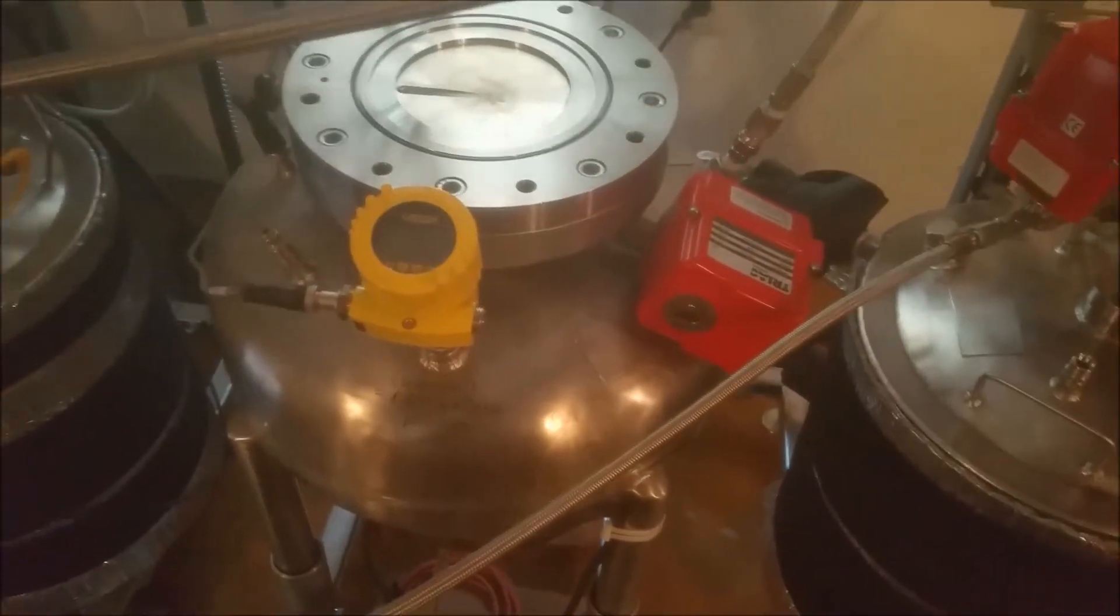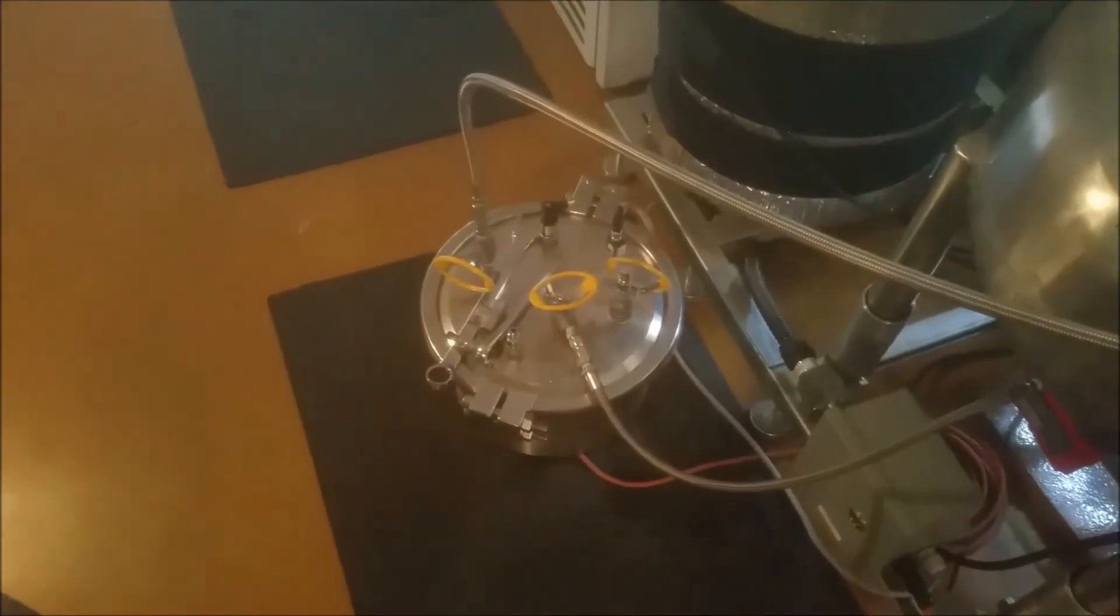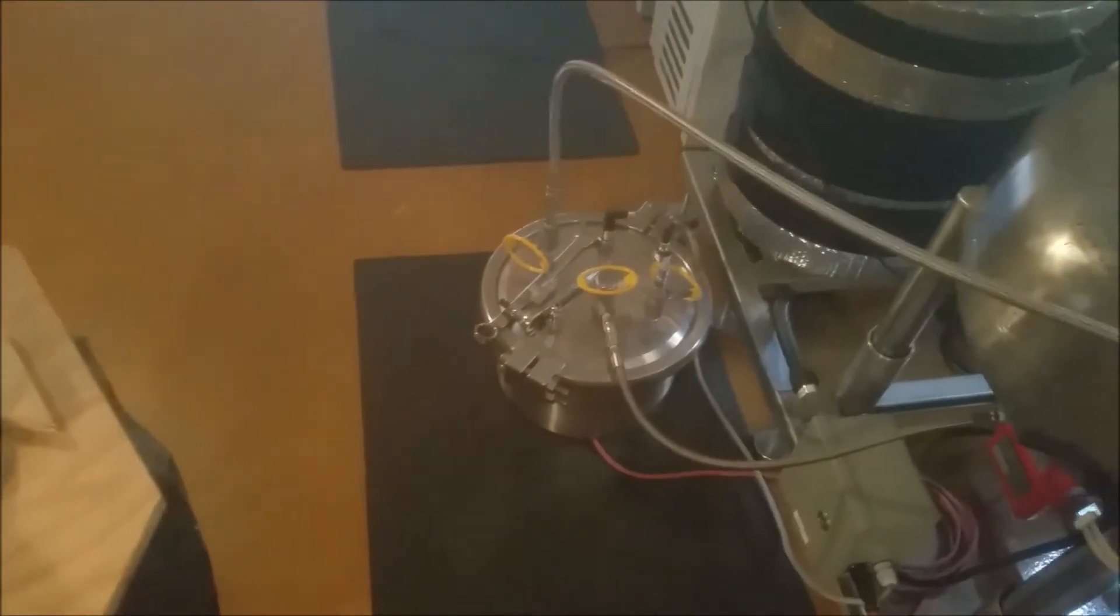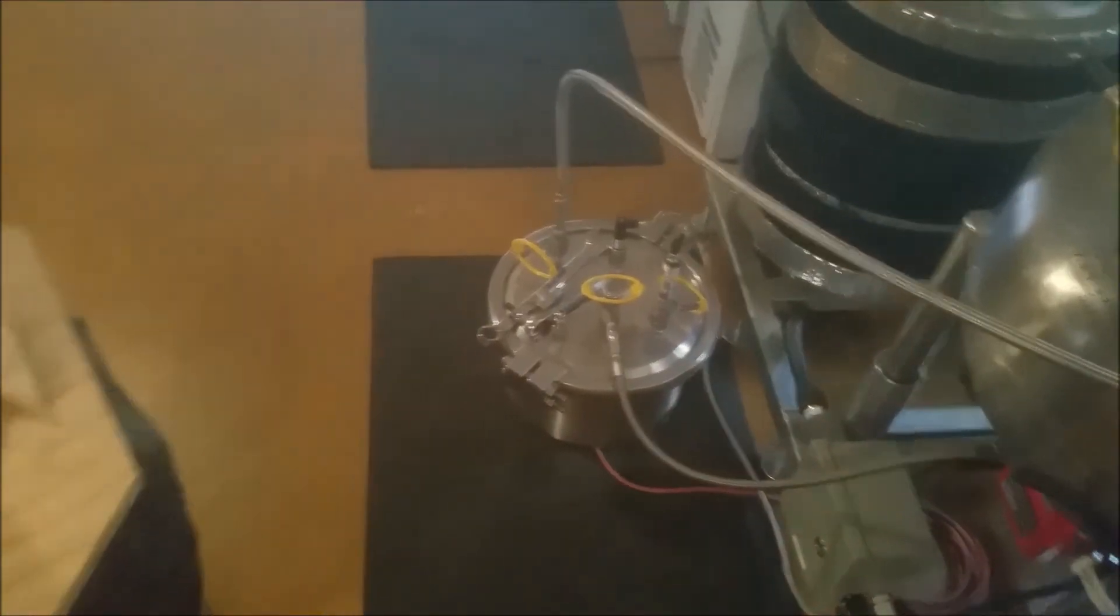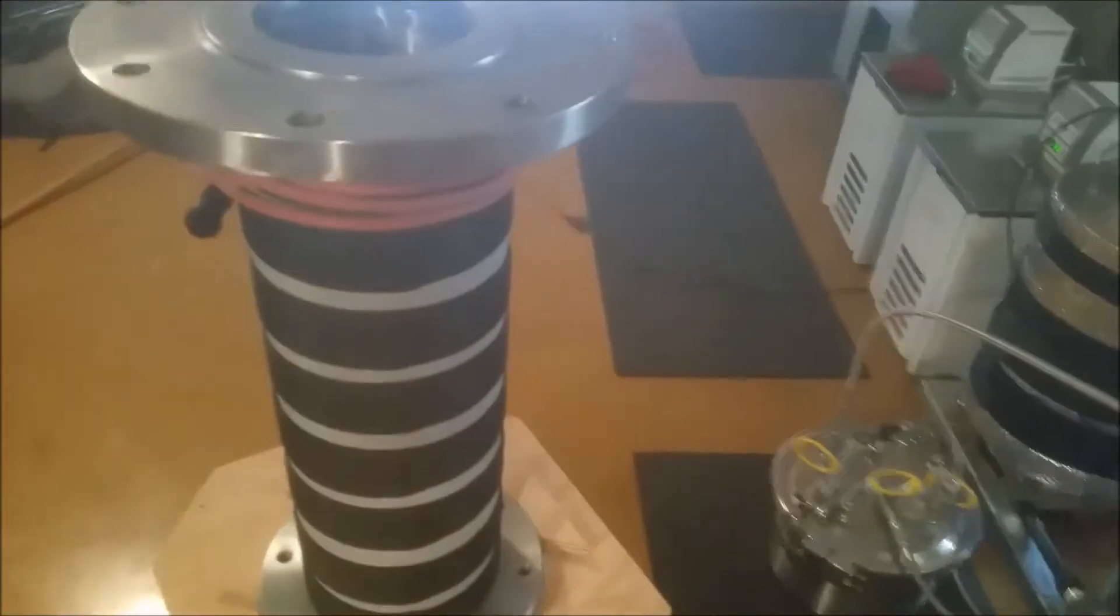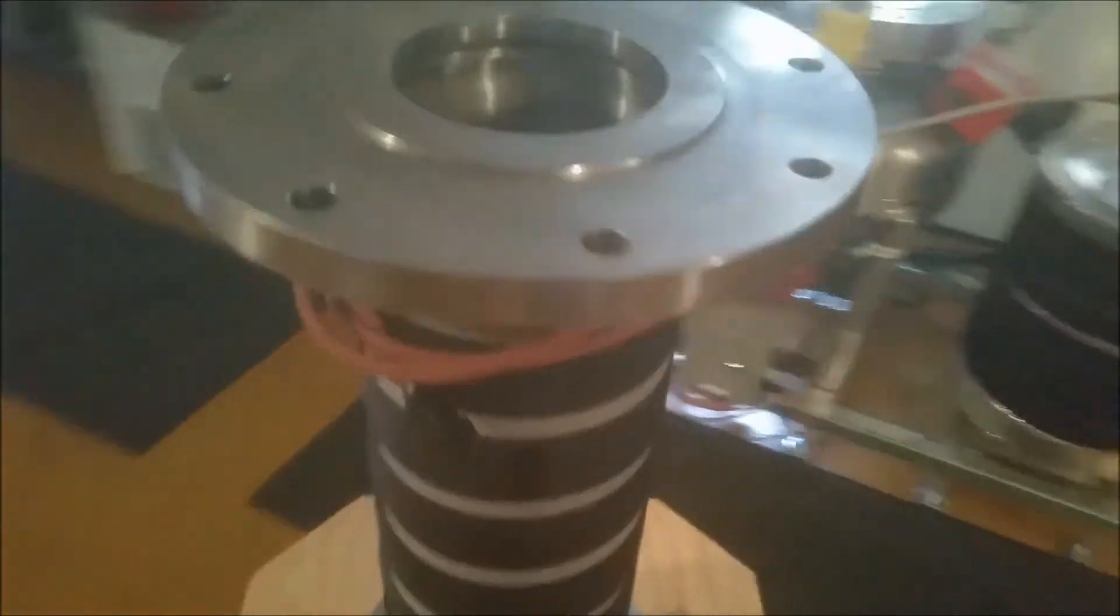There is some solvent pressure left in some of the tanks that are not opened, but when we open the dryer tank to access the extract we have to recover the vapor pressure from that as well as the column that held the plant material.